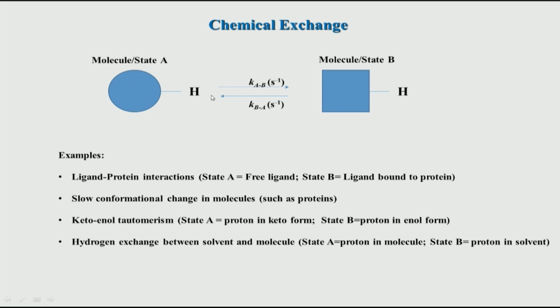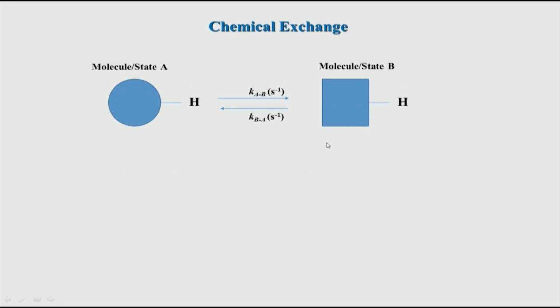Based on these exchange rates, we can now figure out whether this hydrogen is hydrogen bonded or not, or is it buried inside the molecule or not, and that information becomes very useful to have if you want to look at structures. So, hydrogen exchange is a very important experiment which is carried out by NMR to find out the state of the hydrogen bonds.